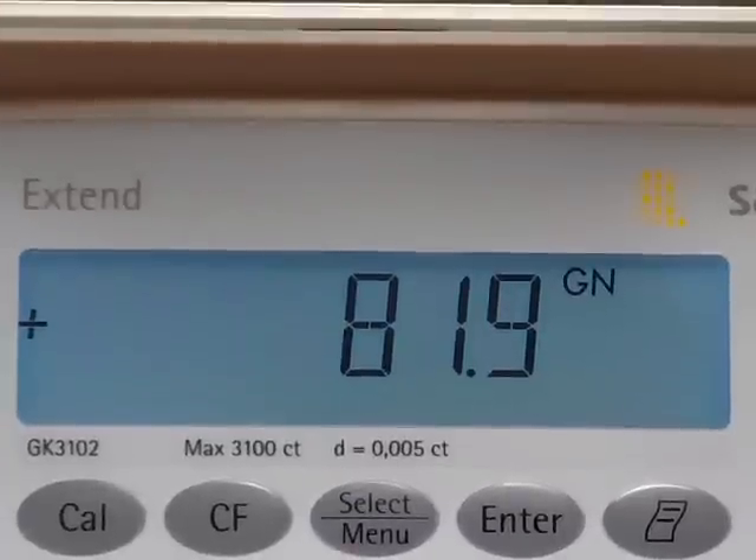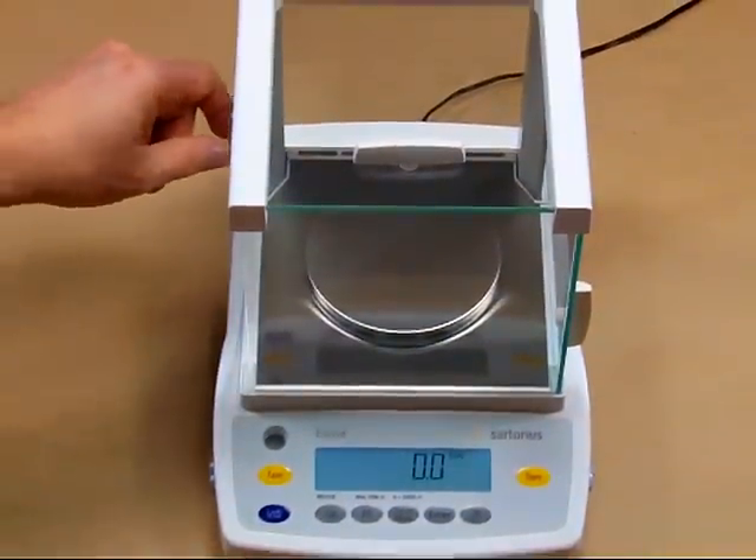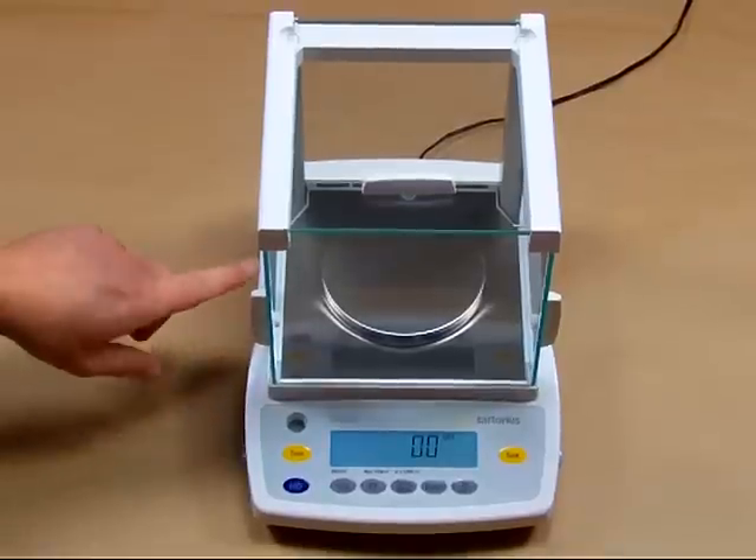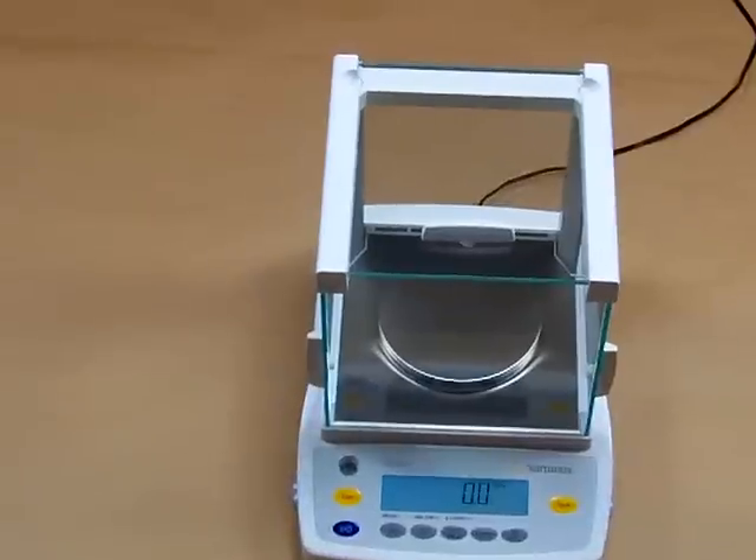The balance comes with a three-year limited manufacturer warranty from Sartorius. The height from the top of the weigh pan to the top of the draft shield is approximately 6 inches.